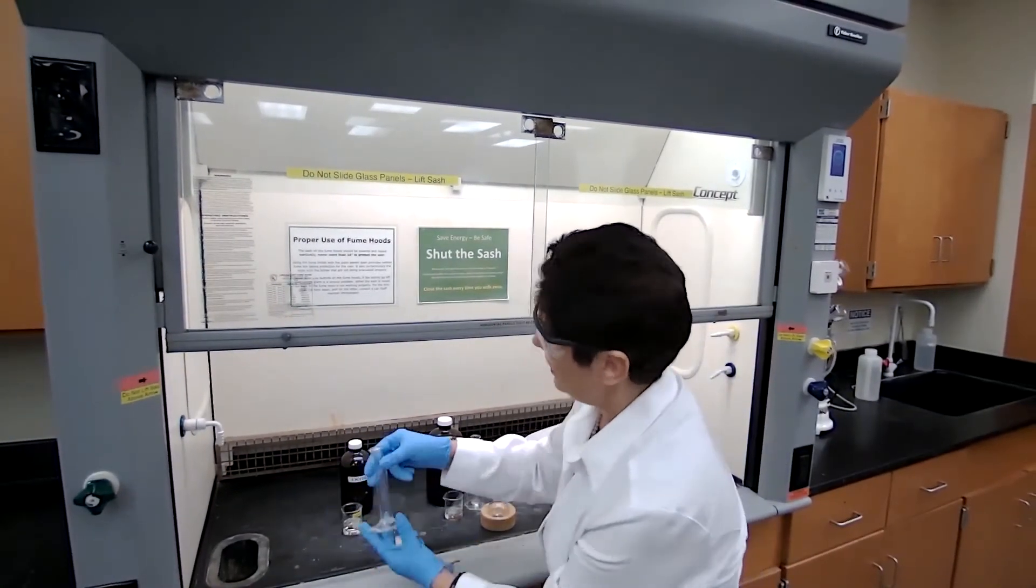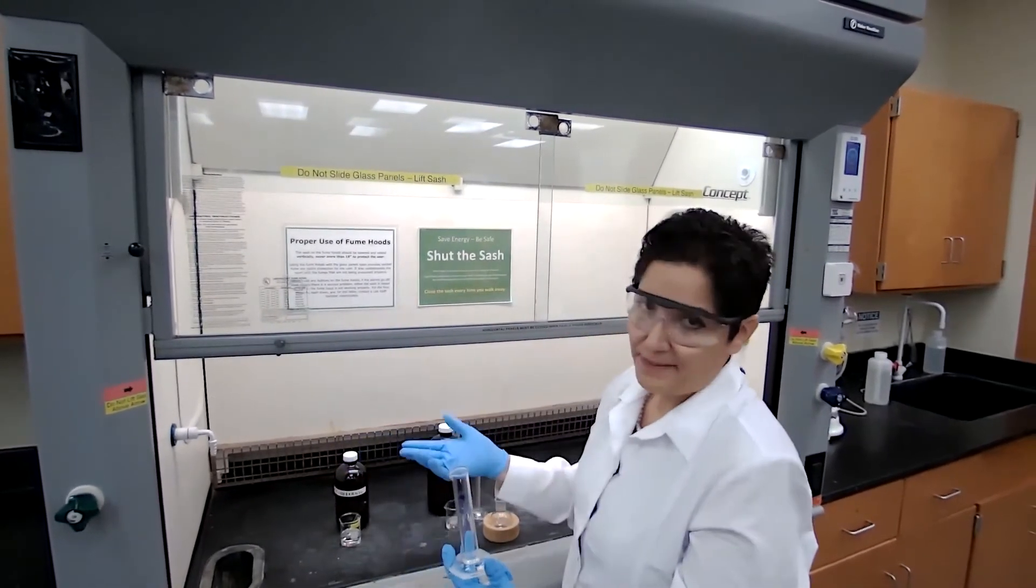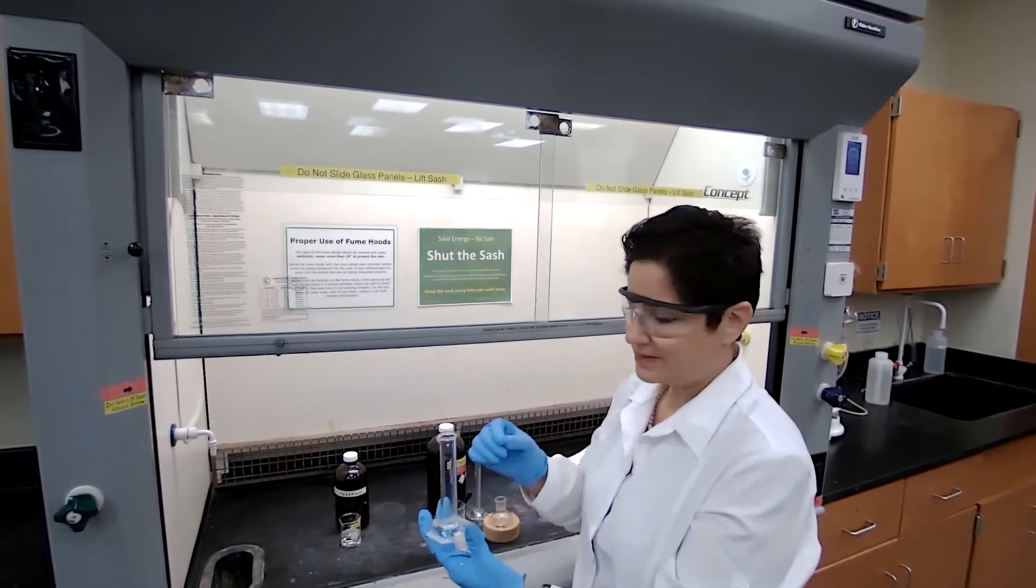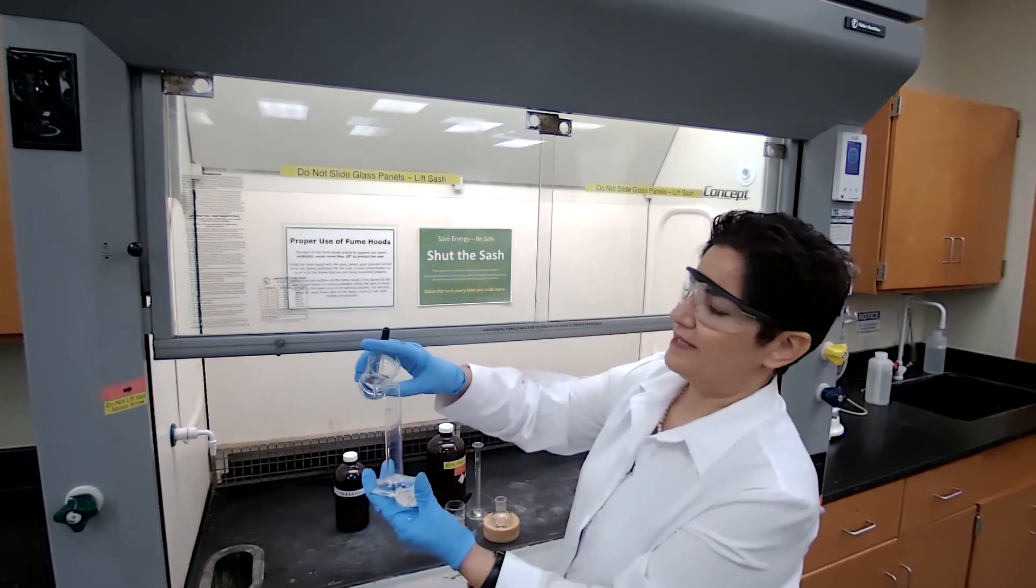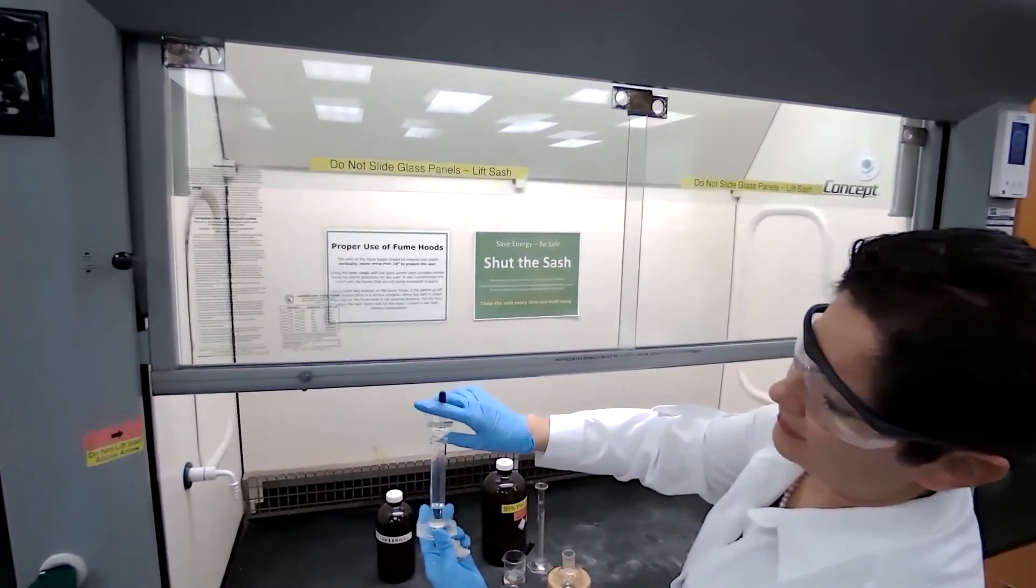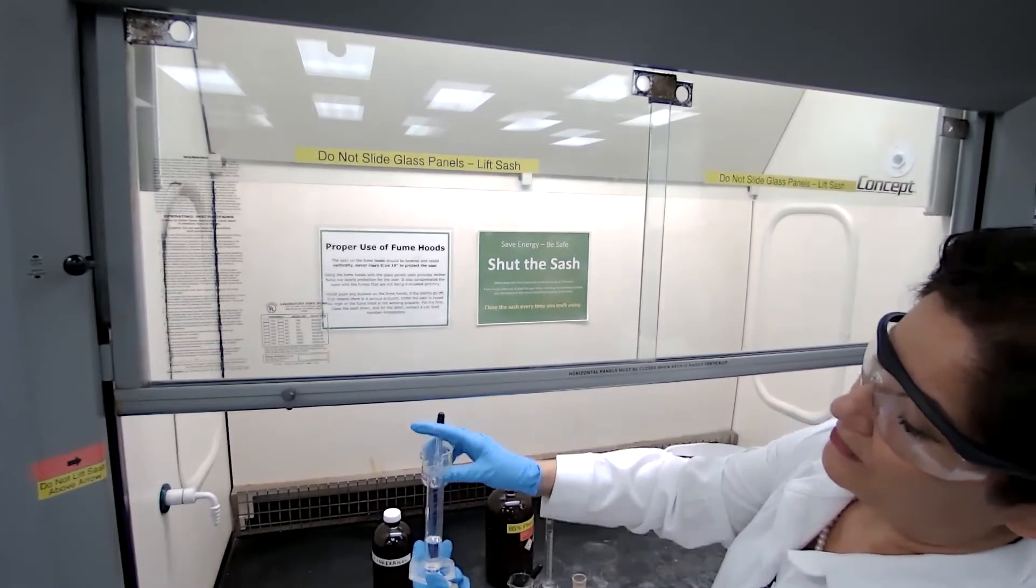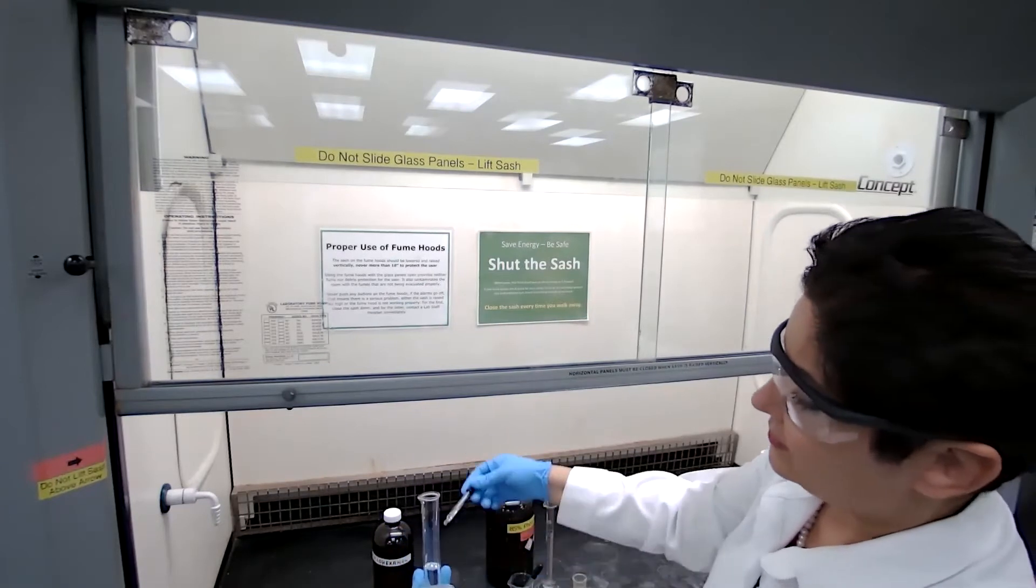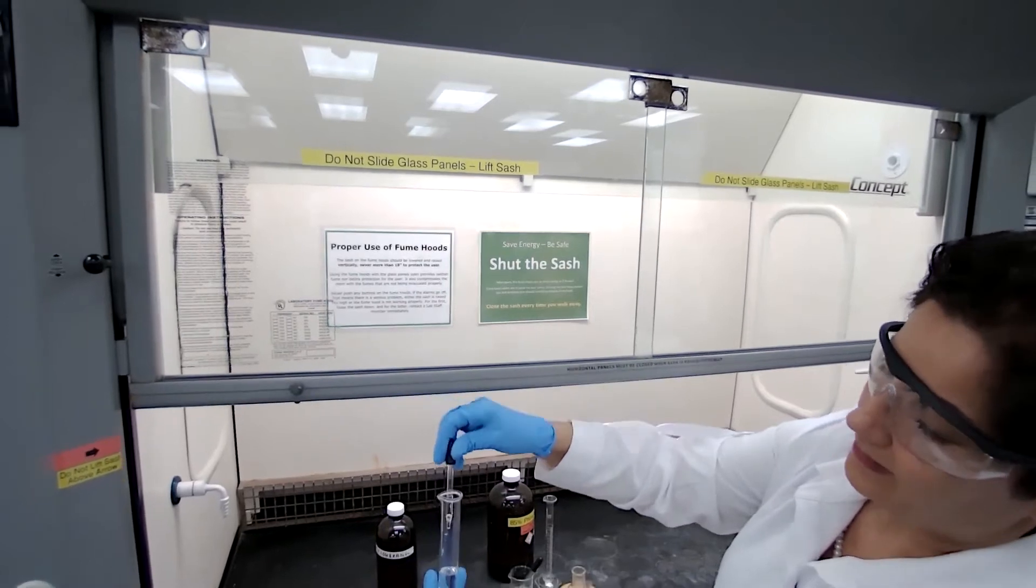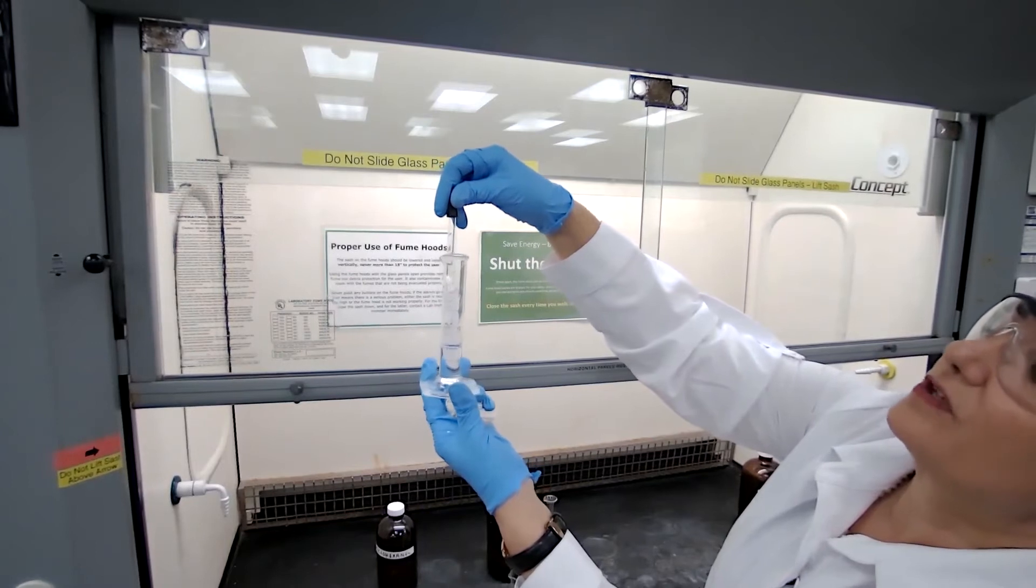For measuring cyclohexanol, we need 10 grams based on calculation using the density, that equals 10.6 milliliters. So I'm going to measure 10.6 milliliters. I often pour first using the beaker, and when it gets close to the mark, then I use the dropper to adjust. I add one drop at a time until it reaches 10.6.